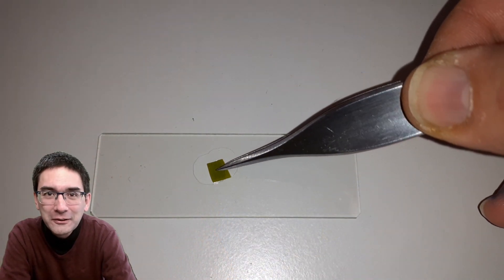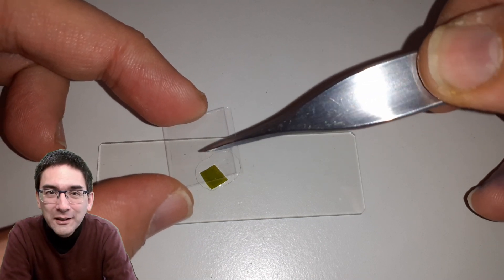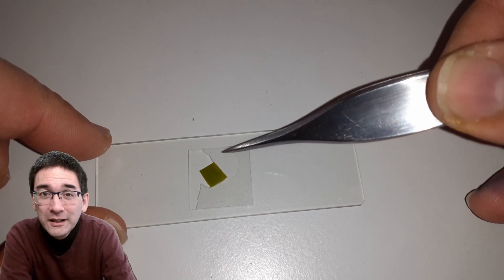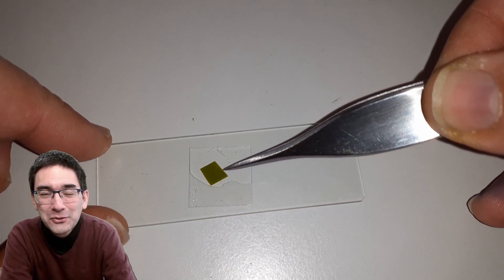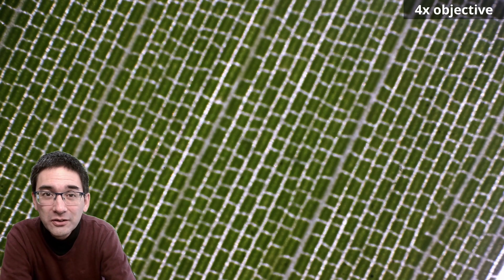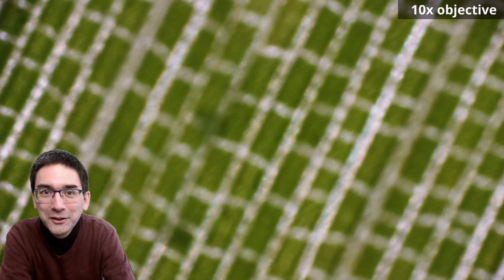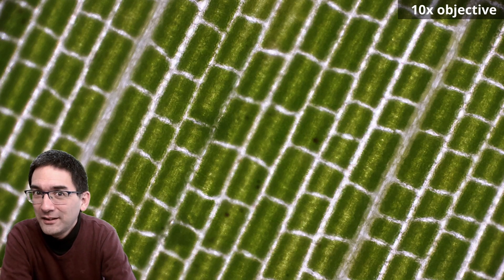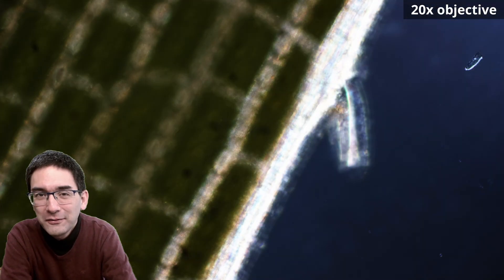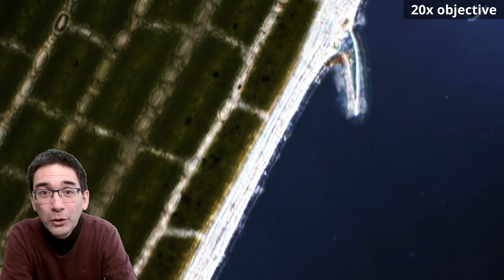My expectations were not particularly high because I know that if you put objects directly under the microscope without any preparation, chances are pretty good that you're not able to see a lot — it's too dark usually, or the specimen is too thick with too little contrast. I wasn't really positively surprised. I said wow, cells! All of those boxes are cells — but then I realized they were way too big. These cannot be cells, and when I increased the magnification, sure enough, these structures were way too large to be cells.